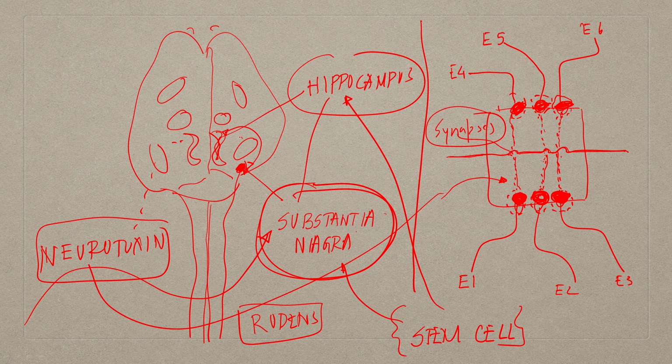And that can happen in the brain itself through cerebrospinal fluid, right? Now, you see how this neurotoxin is influencing the electrical activity here. Is the electrical activity getting compromised, and how much time does it take? As I mentioned, you can do a lot of chronic experiments. Okay.